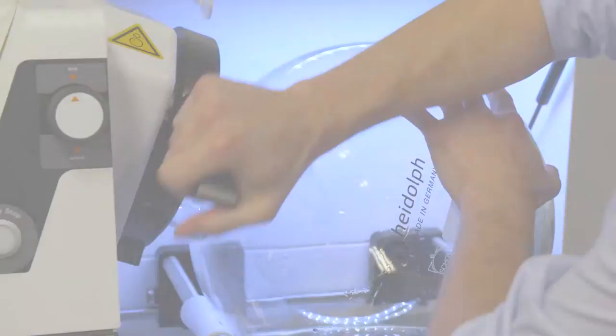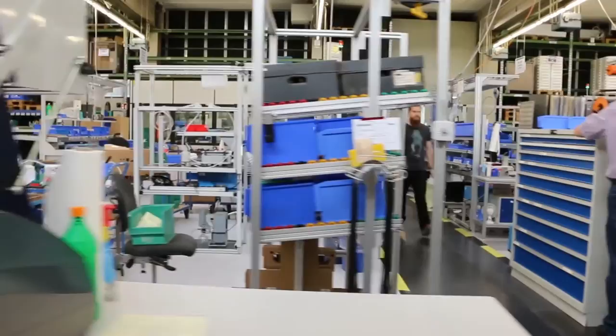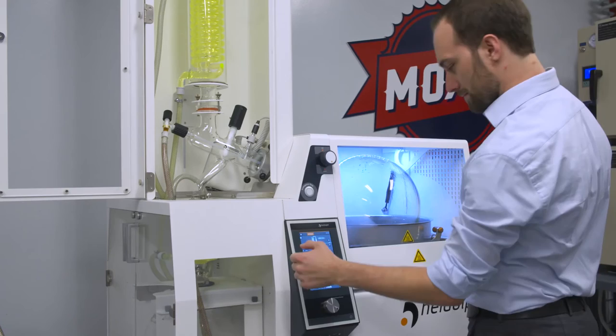In addition, their rotary evaporators offer the highest level of automation, making them easy to use for people without previous experience. Better laboratories with better equipment make better medicines. When you're producing the best-in-class product, you have to use the best-in-class tools. With Heidolf, not only do we have a machine that is intuitive to the user, but it produces parameters that are completely reproducible every time.